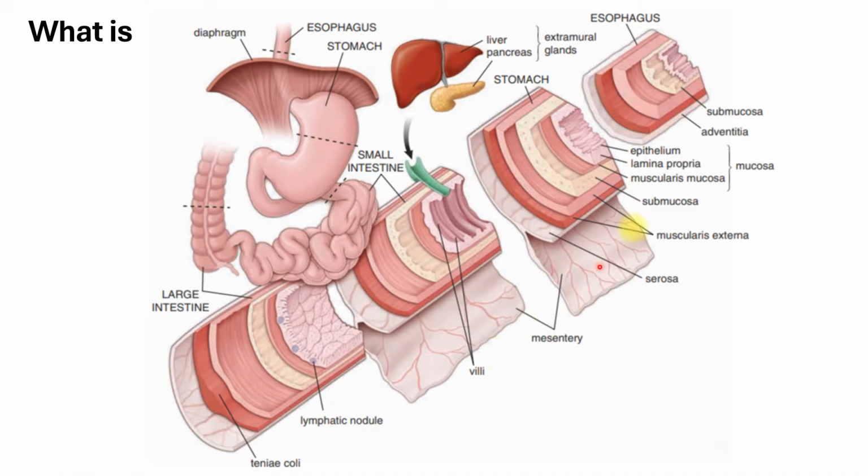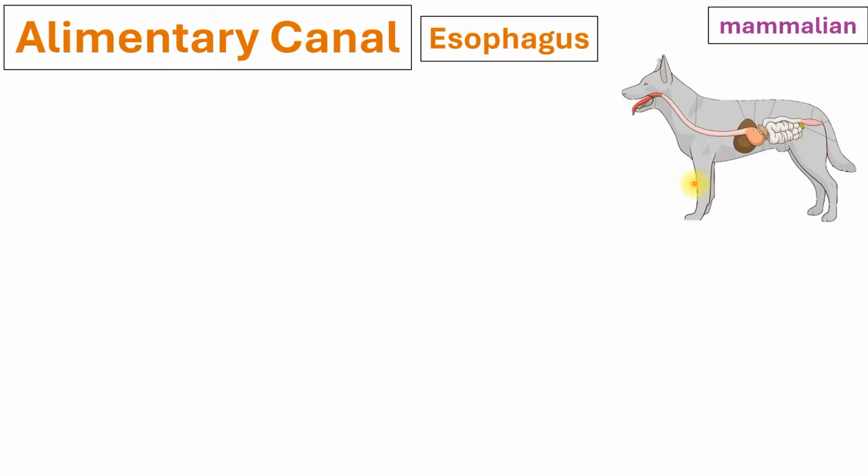Okay? Again, here, you can see that from the esophagus until the large intestine, actually, all of these layers are almost always present, and then they just differ in the innermost lining, the epithelial layer, and some layers, such as your muscularis mucosa of your tunica mucosa, may either disappear or be present or become well developed, etc. Okay?